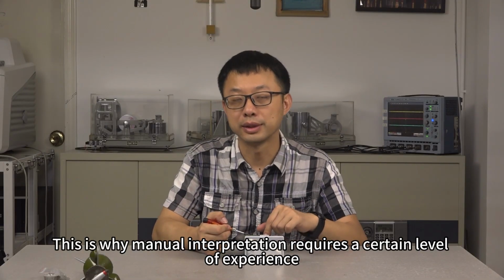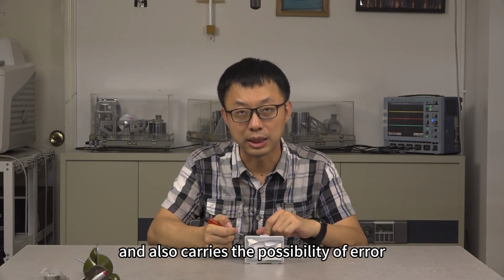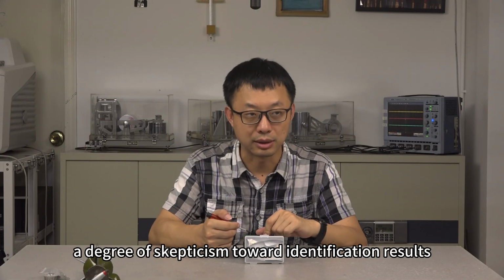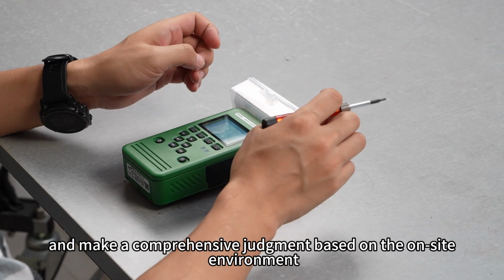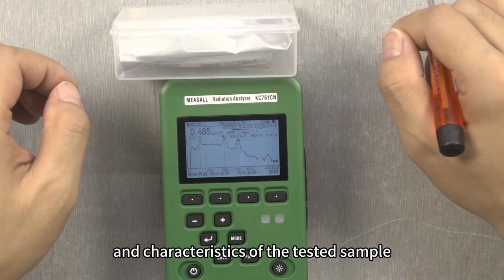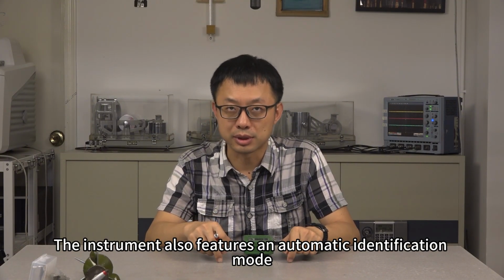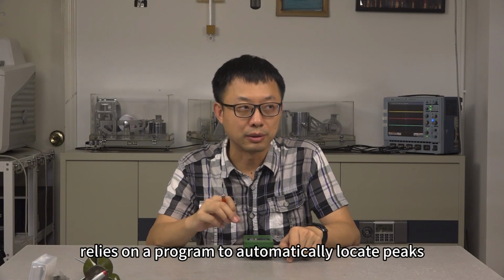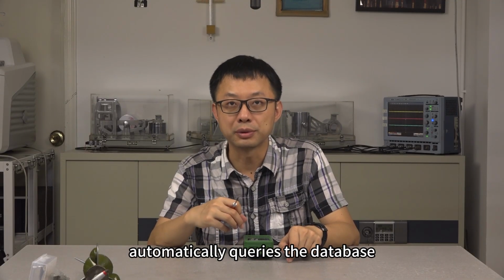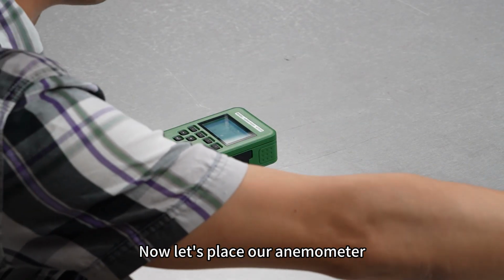This is why manual interpretation requires a certain level of experience and also carries the possibility of error. Typically, one should maintain a degree of skepticism toward identification results and make a comprehensive judgment based on the on-site environment and characteristics of the tested sample. The instrument also features an automatic identification mode. This method relies on the program to automatically locate peaks, automatically queries the database to match the detected peaks with corresponding nuclides.